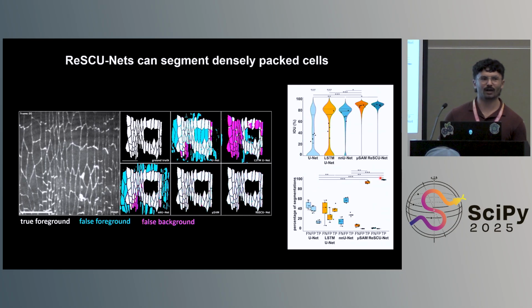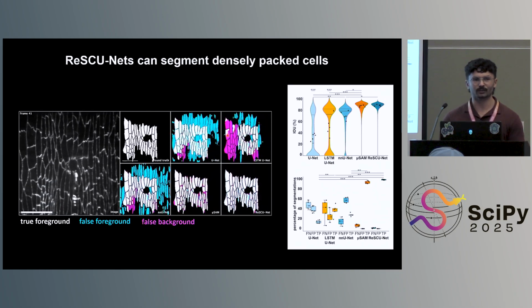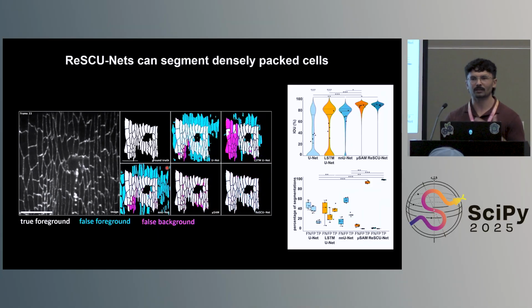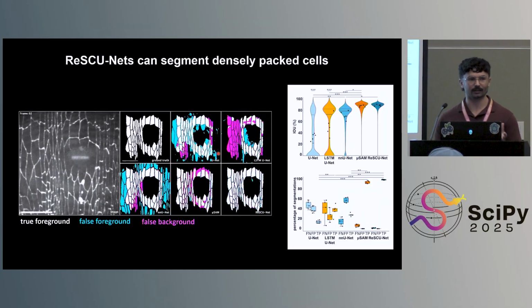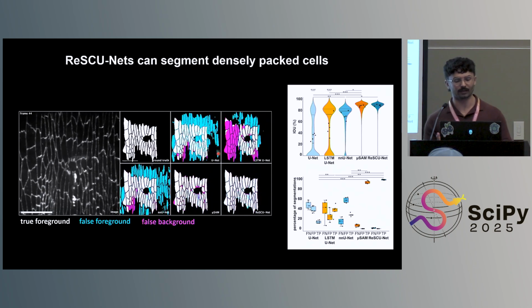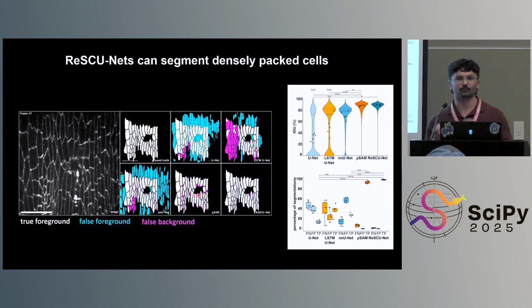And finally, perhaps the most dramatic data set is these cells around the wound. So once again, we see that in those non-prompted networks, we have lots of false positives, and perhaps unexpectedly, also many false negatives. So they're adding cells that shouldn't be there and removing cells that should be there. SAM is able to get all of the cells that you want.